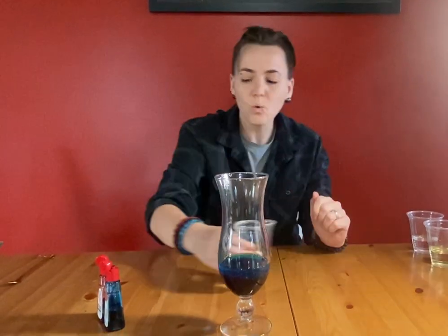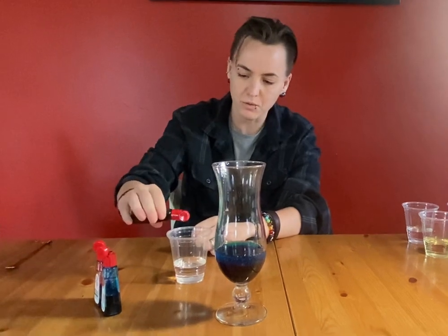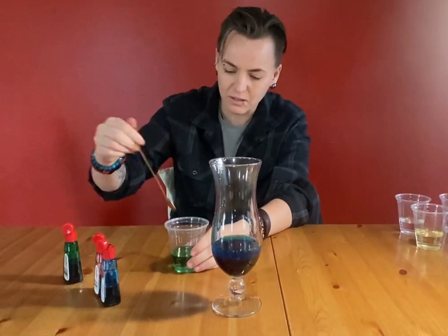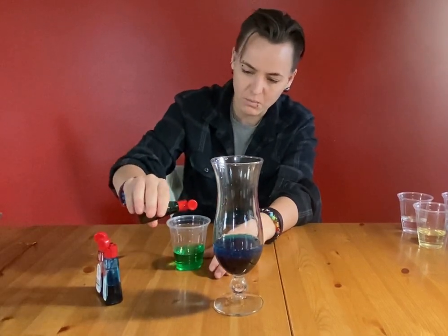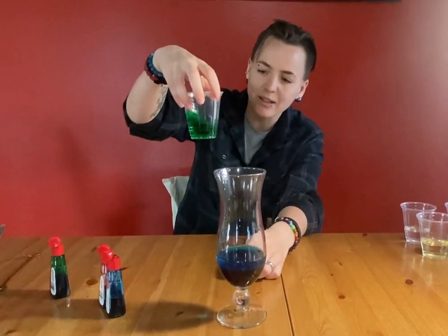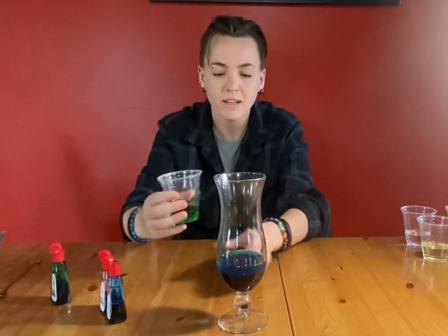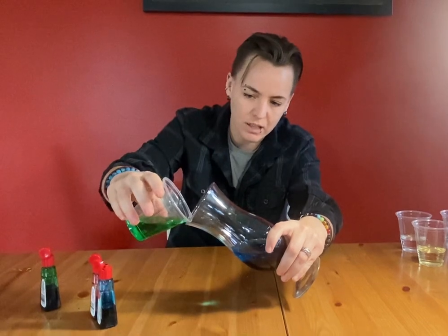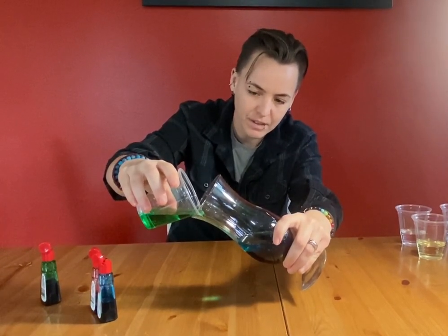And then we have water. And in order to make our rainbow, we are going to add a few drops of green food coloring here. And this is going to be the green component. Maybe we want it to be a little bit more green than that. So let's add and we'll swirl it around. Again, this is actually something that we do in chemistry, which is called swirling. So you swirl it, and then we're gonna once again tip this to a 45-degree angle, and we're gonna slowly pour this in. Just like that.